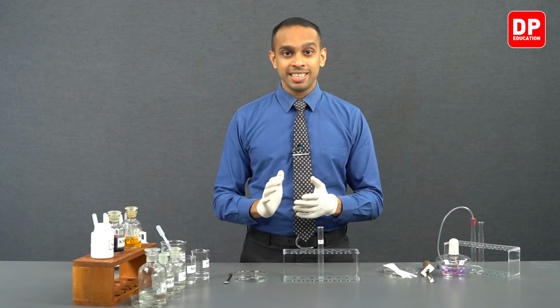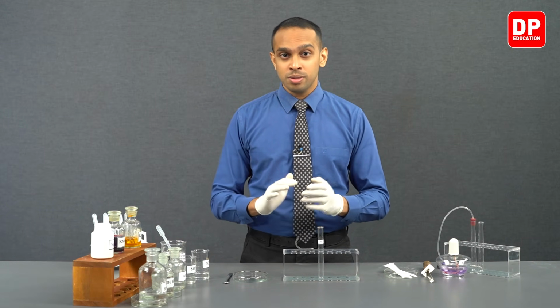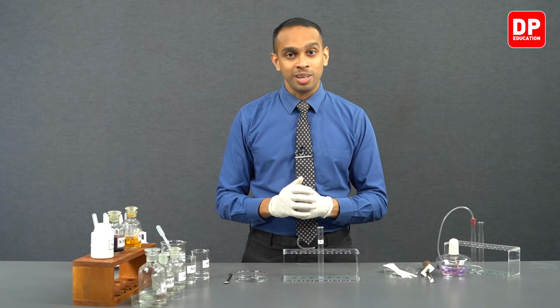Now, in this part of our experiment, students, we are going to observe how a solid sample containing sulfide ions reacts with HCl. So we have sodium sulfide here, and we are going to add to it a small amount of hydrochloric acid.